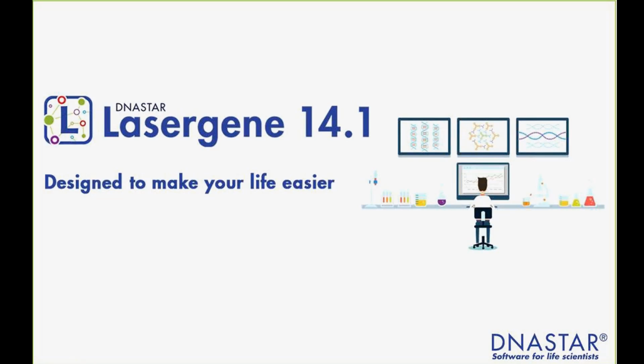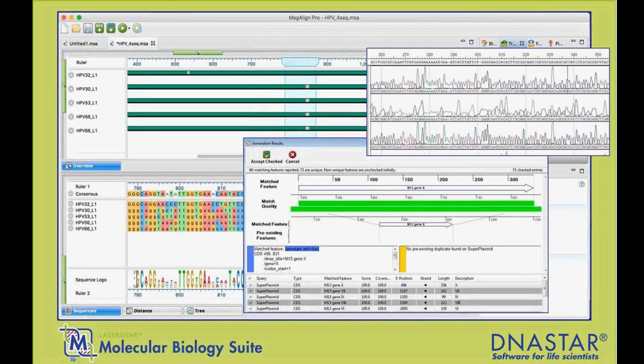And Lasergene software has wide-ranging functionality. Then I'll kind of give you an overview here. It can be things like molecular biology. So this is just some screenshots of our molecular biology suite that provide capability such as Sanger sequence analysis. I have a screenshot here of some annotation results for plasmid annotation, multiple sequence alignments. So all the basic tools for doing analysis of sequences are part of our molecular biology suite.